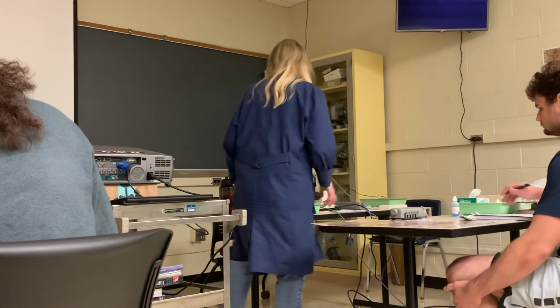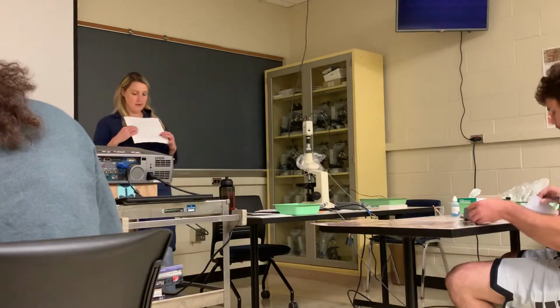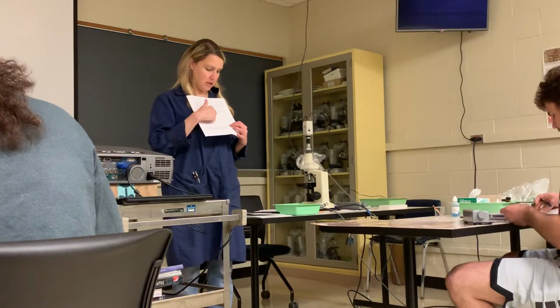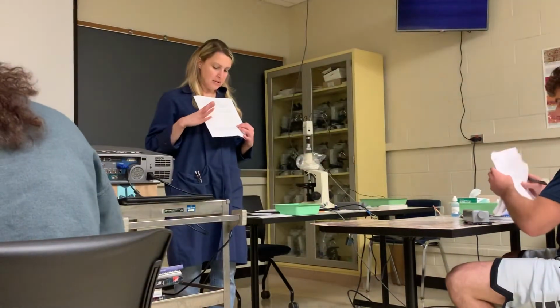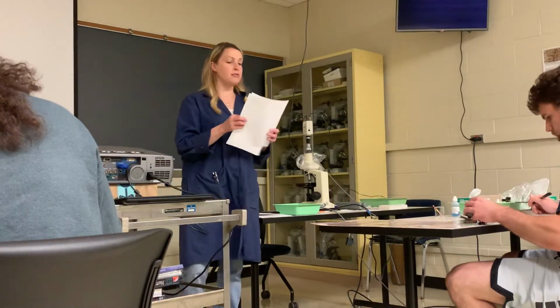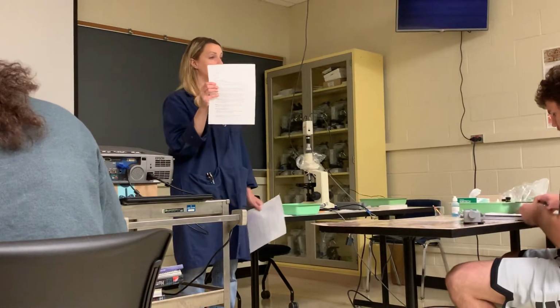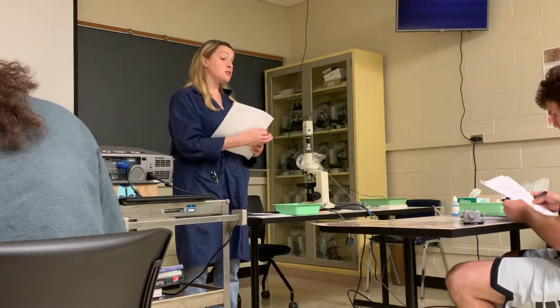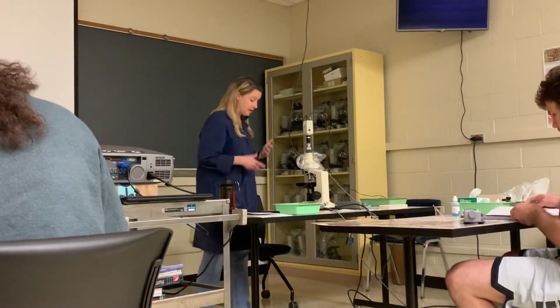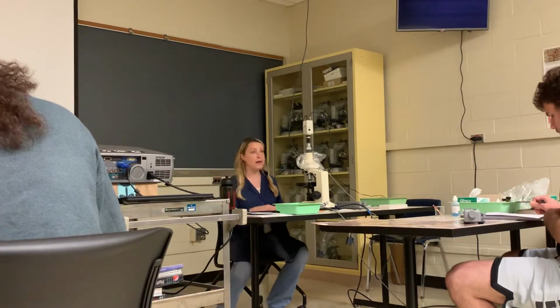And then what you can do is you can write your numbers down on the second page of your lab printout, where this table is, which shows you the normal percentages of each type of cell, and you can see what your percentage is. And you can look to see if you see an elevated number of a particular type of cell, you can look at your specific white blood cell number indications and figure out maybe this person has this or that. Because all of these blood slides, they're from people and they could have problems. You know, they could be sick or they could have mono, something like that.